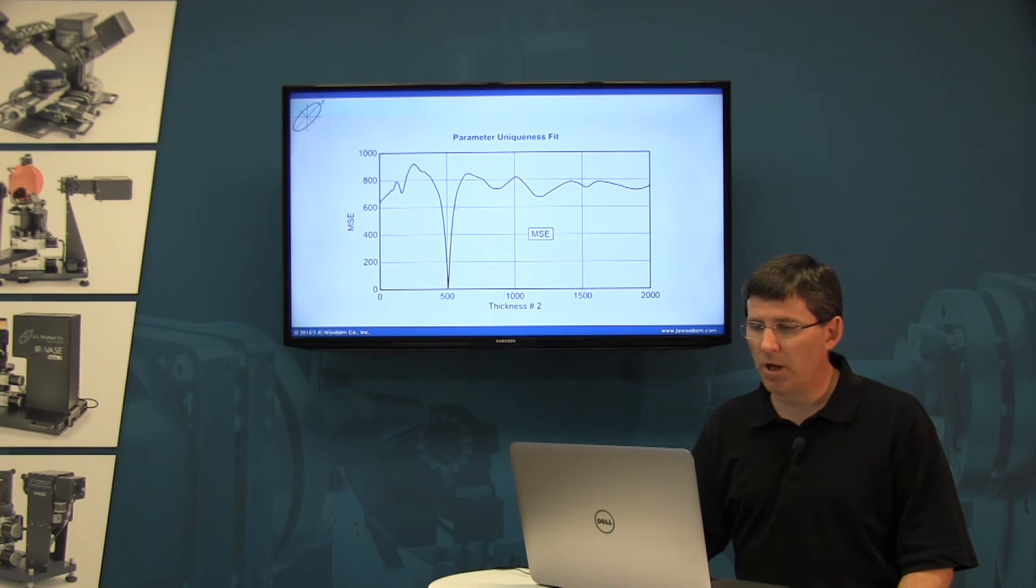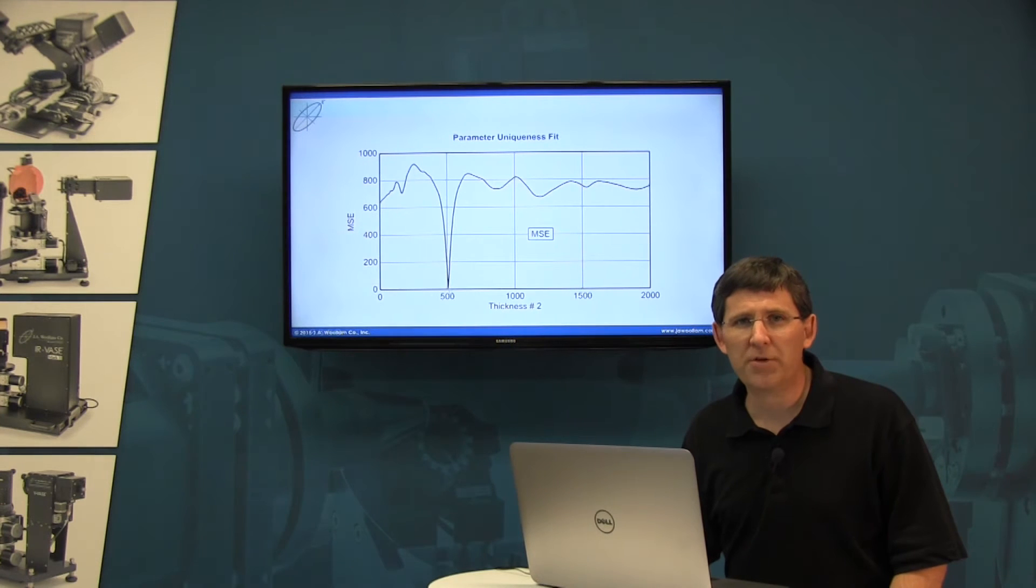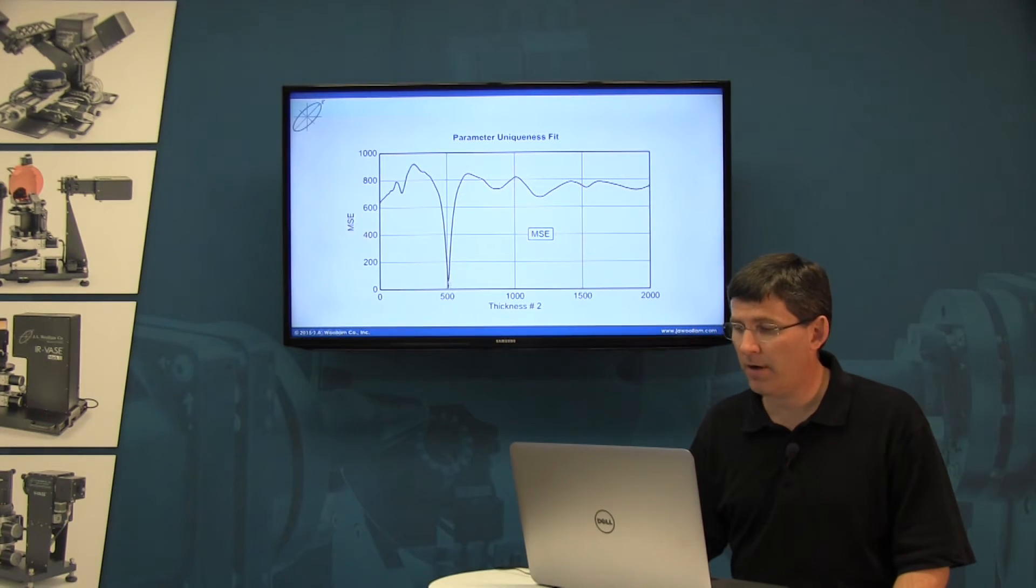If I'm close to the correct result, which is really close to 500 angstroms, or 500 nanometers in this case, the MSE can find the correct minimum.